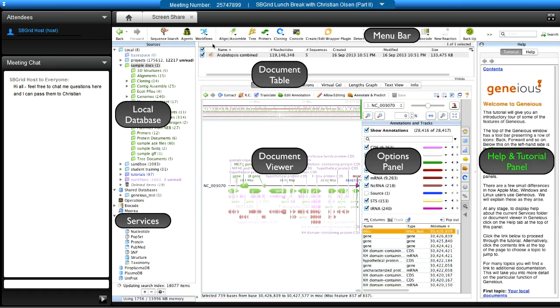To the right is the help and tutorial panel for users getting started — for example, learning how to build primers on a multiple sequence alignment. If you're a more experienced user you can shrink that panel to increase screen real estate. At the very top is the menu bar with icons for starting processes such as sequence search or PCR cloning. You can customize the menu bar with additional icons.